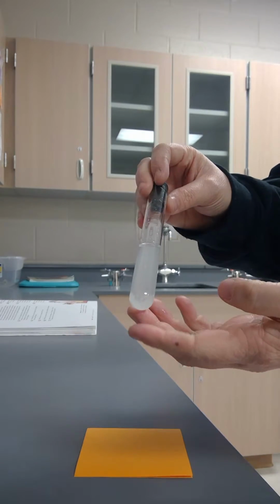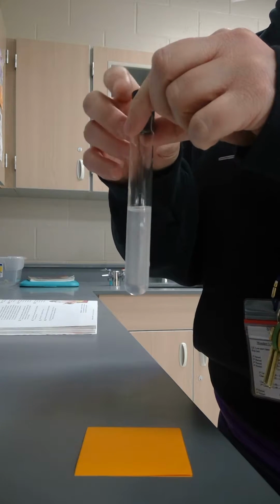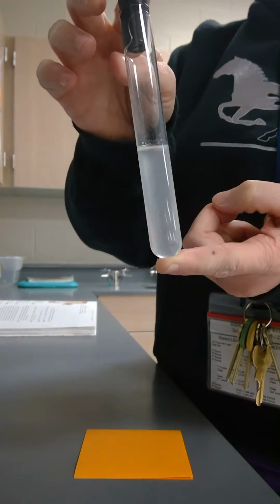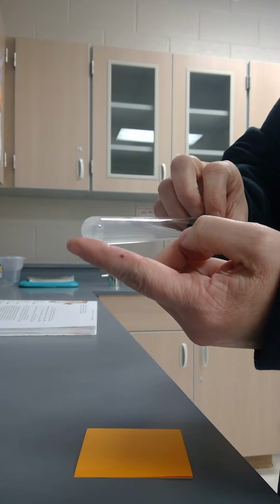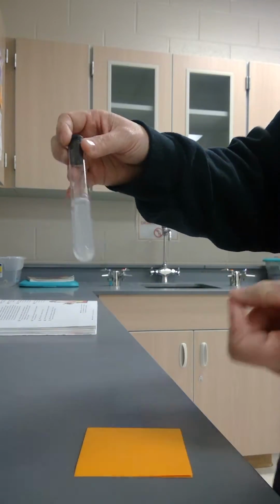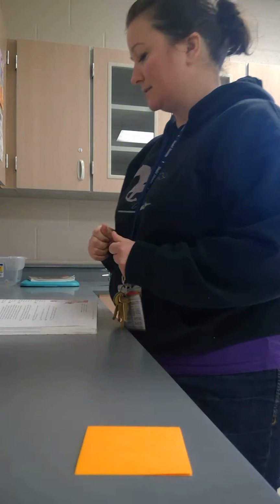So I've mixed it. Now, again, I've got my chart, and it says after being mixed, you're going to go ahead and document what happens. So I want you to think about, is it soluble? What do you see? Write down all of those observational properties. How well did it mix? Did it mix 100%? Is it a partial mix? And then document that on your sheet. Then we'll move on to the next substance.